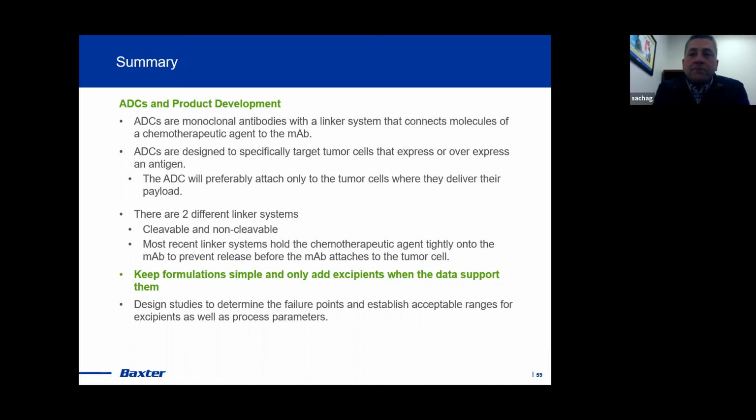These molecules such as sucrose and trehalose, when you freeze them and dry them, they remain amorphous. And when they remain amorphous, they have a lot of water associated with them. And so water acts as a plasticizer. So as you increase the temperature, even during your secondary drying, they can become slightly flexible. And when they flex, they shrink away from the walls of the vial. You'll always see some shrinkage. The goal is that you're not using such high temperatures that they shrink severely and don't provide a decent appearing solid.